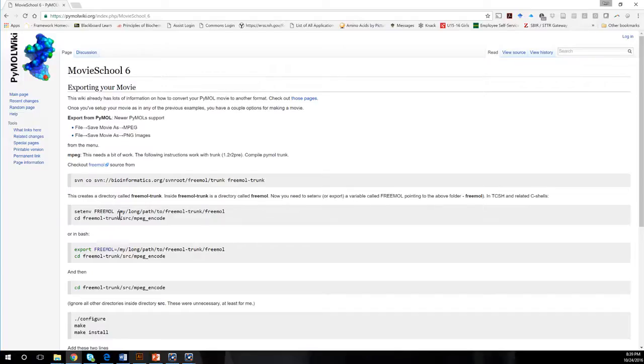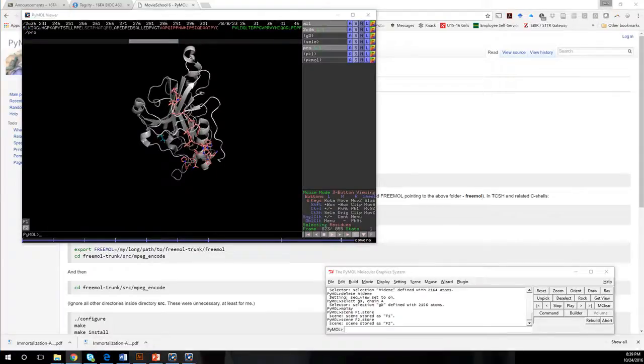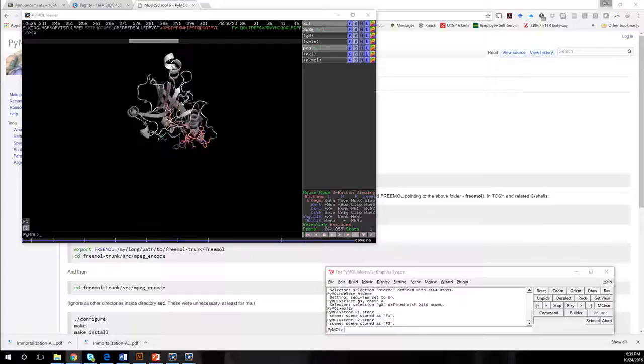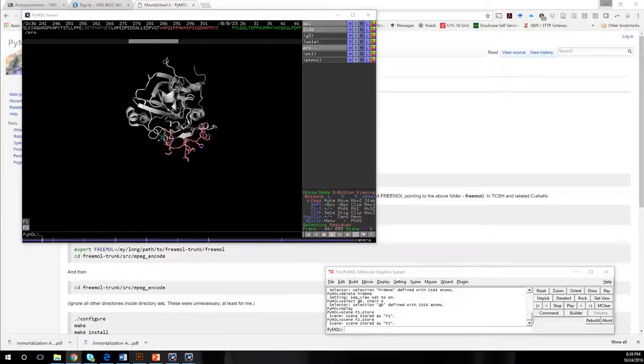I'll probably do one more on UCSF Chimera tomorrow. One more video just to give you an idea. As you can see, this isn't too difficult to do once you get the hang of it, but it does take a little bit of effort.